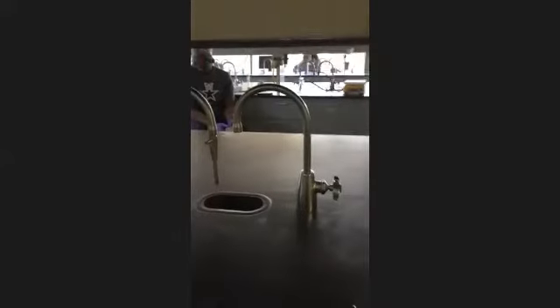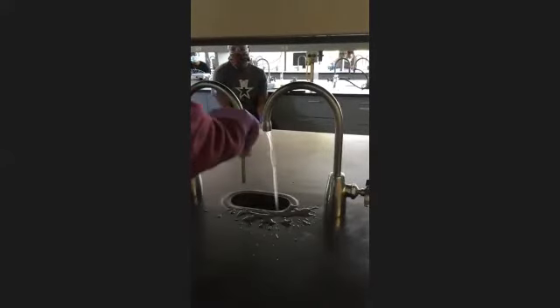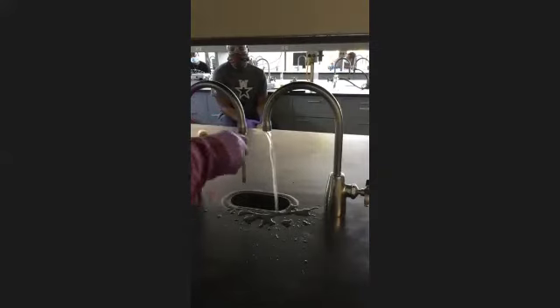Right here, you can see on the sink, you see the aspirator, the little nipple coming off the side. So we're gonna set this up. And got that, yeah. Oh, that's tight. Sometimes if your tubing is too small or it's really tight, if you put some water on that little nipple, you'll be able to slide it right on there.